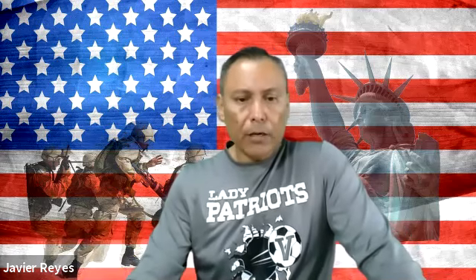You have to put equal size tubes. So the other day we put 3 tubes of the same size with almost the same amount of blood, right? One of them was a little bit less, but it was pretty even. So same size of tube, the same amount of blood, okay? And they have to be separated. If the machine has 6 slots and you have 3 tubes, then you put one and skip one, and another one, skip one and another one, right? So they're kind of balanced out.